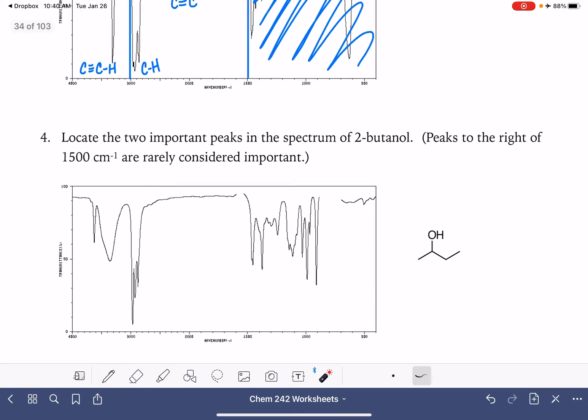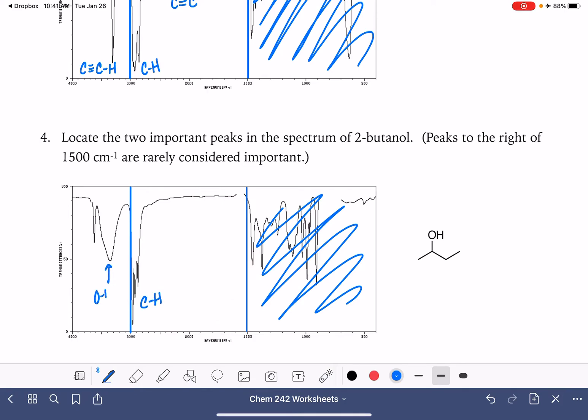Locate two important peaks in the spectrum of butanol. Here's our two butanol. Here's our two butanol molecule. Let's go ahead and mark off the parts of the spectrum that we want to focus on there. So we're ignoring all of these things over here. There is really nothing in this area right there. These are our carbon hydrogen peaks and this right here would be our OH peak.